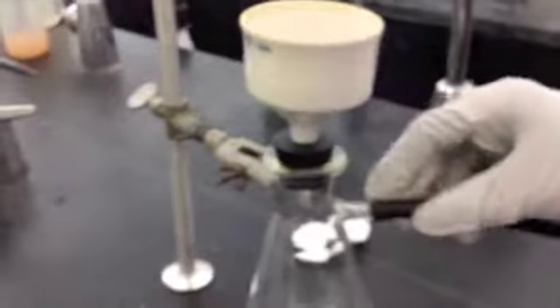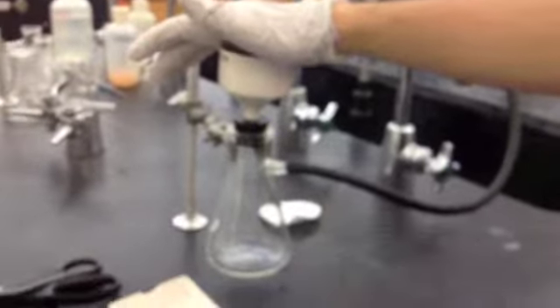Now the Buchner funnel is connected to this flask, which is connected to a solvent trap. And the solvent trap is connected to the aspirator here in the sink. We have the water running, and what this is doing is actually pulling air and creating a vacuum here. If you're wearing gloves, you can put your hand on the Buchner funnel and you can actually feel the air being pulled, and your gloves will go like this in the funnel so you can tell that the vacuum's working.